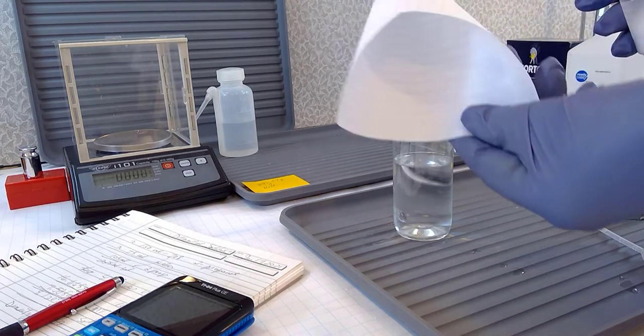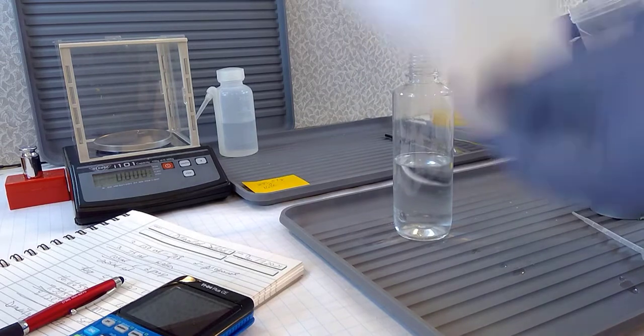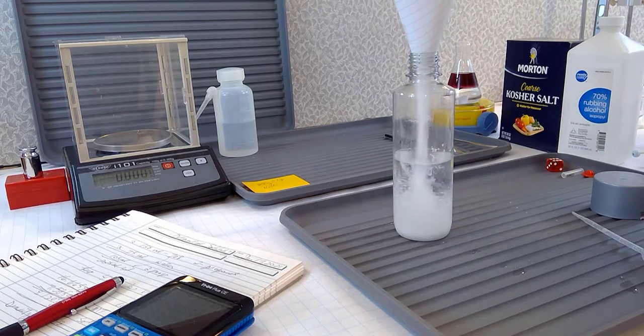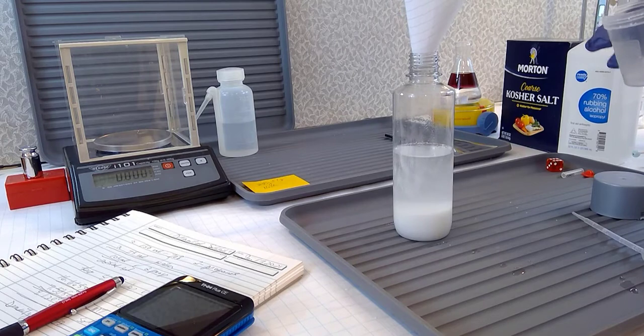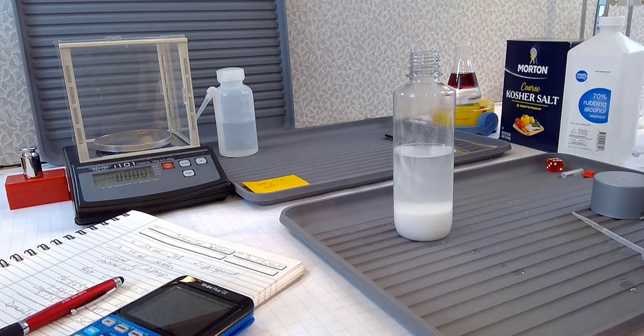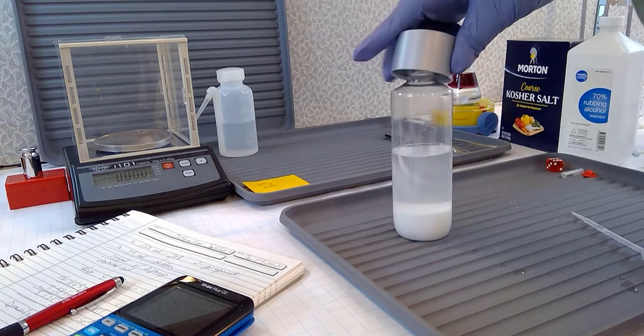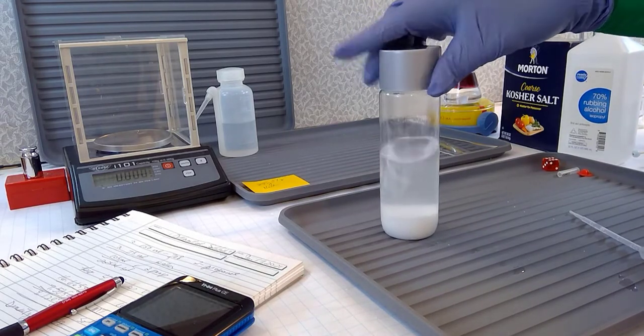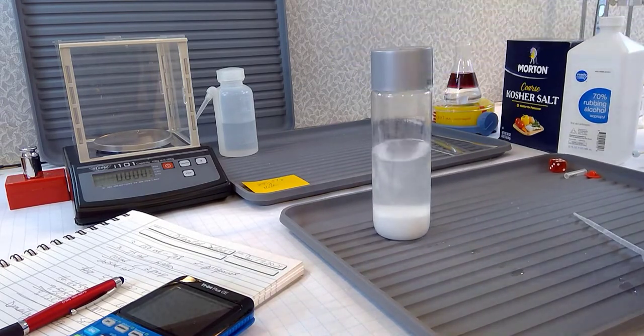Now I made a little paper funnel to get this in there. I just rolled up some paper, cut the end off, and I'm going to dump the salt in here. There we go. You just hear it pouring in there. That's quite a bit of salt. And I'm going to cap it. There we go. Now we're going to have a competition.